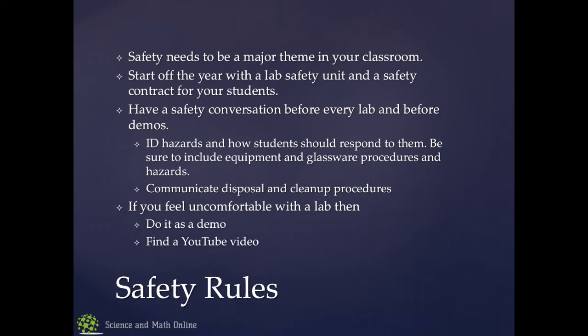Okay? So you need to make sure, once again, that you go over lab safety at the beginning of the year, and that lab safety is something you talk about every time you walk in that lab, every time you do a demo. You're telling the kids, hey, you need your safety glasses on, and you need to be back 10 feet. And if some kid comes within that 10 feet while you're doing a demo, you stop, and you make them back up. Because you've got to be strict on this. This is one of those things you have to do.